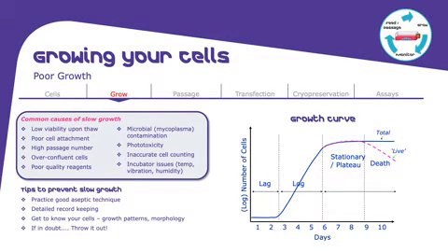It either can be contaminated. As I mentioned, mycoplasma is not visible and you cannot see it. It might be that you have some issues with an incubator. As I mentioned, the temperature can be a problem, the humidity level, maybe there's some vibration next to the incubator as well. It might also be that something else is making your cells unhappy with the media or the supplements. So the growth curve is a very, very nice internal control for you.